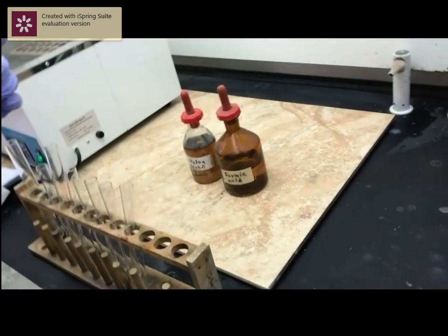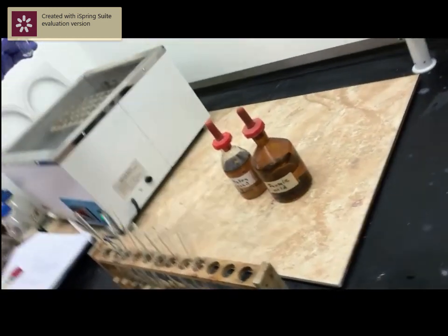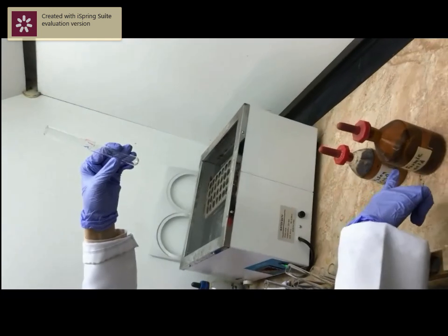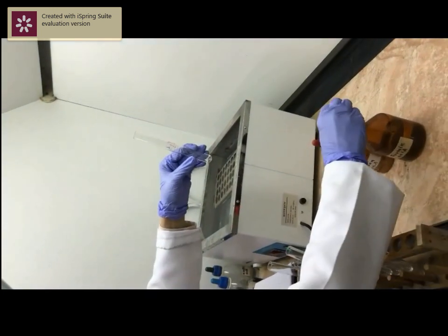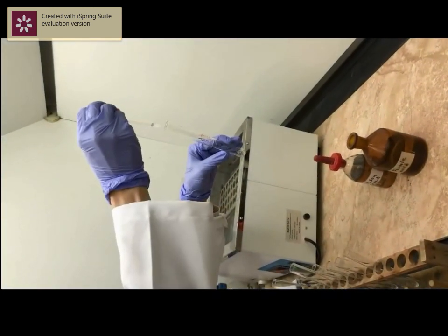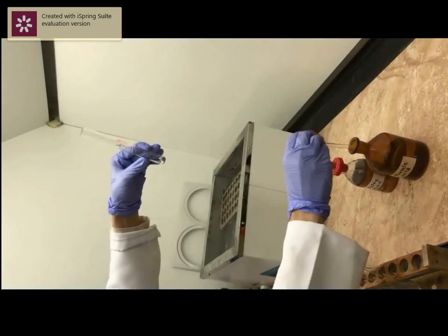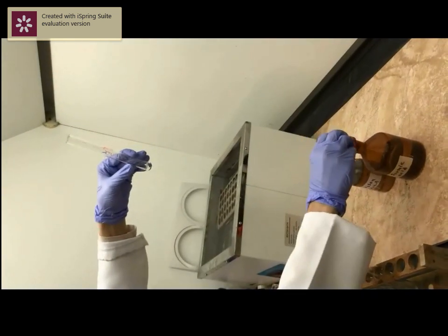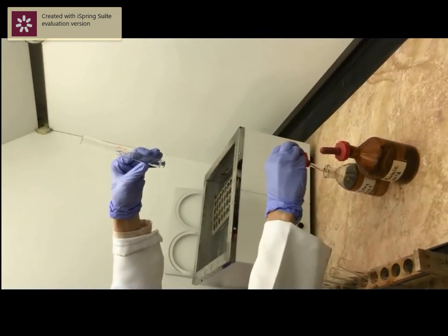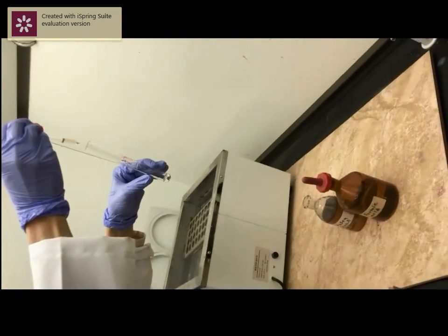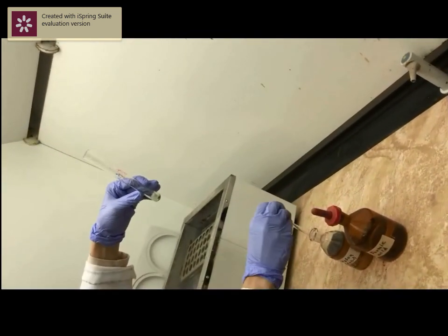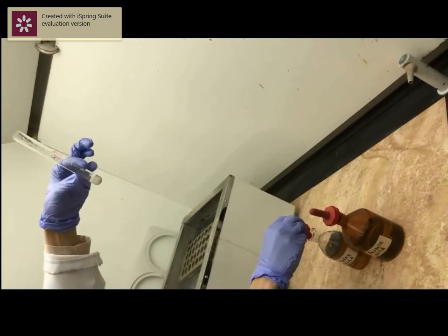To start with, begin with a clean test tube and add 1 ml of formic acid. Then add 1 ml of concentrated sulfuric acid. Ignite the bubbles.